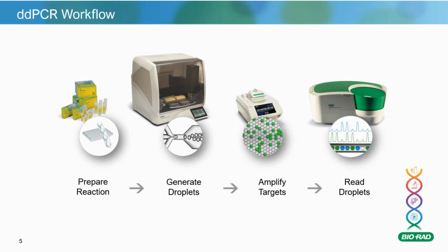And there's two methods of doing this. You've either got your manual droplet generation, where you take 8 wells at a time, you move them into a cartridge, and you mix them with oil, and the system partitions for you, which takes around 2 minutes for 8 samples. So you get around 20,000 droplets or partitions per well for all 8 wells in 2 minutes.